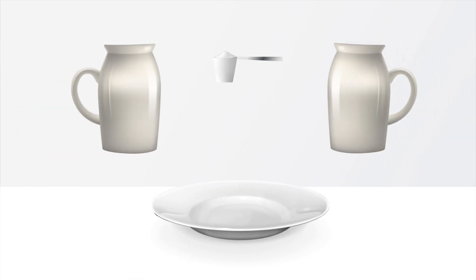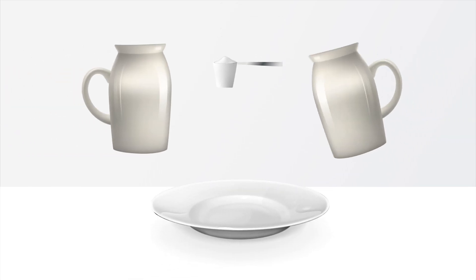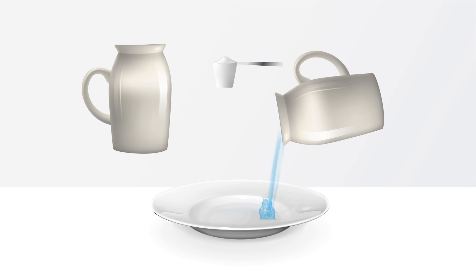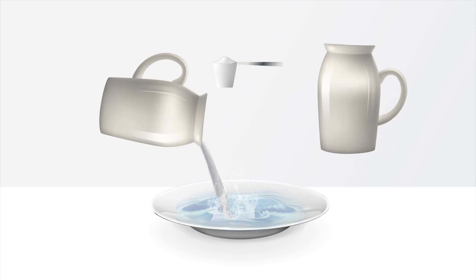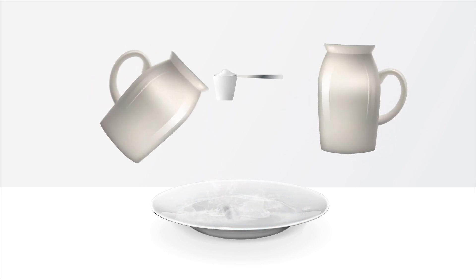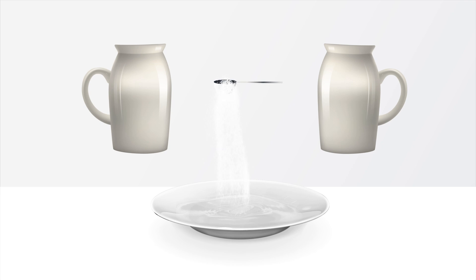When it's time to standardize milk for the cheese vat, the Lactoscope FT-IR is indispensable for calculating the required ratio of skim cream and adjusting protein levels.